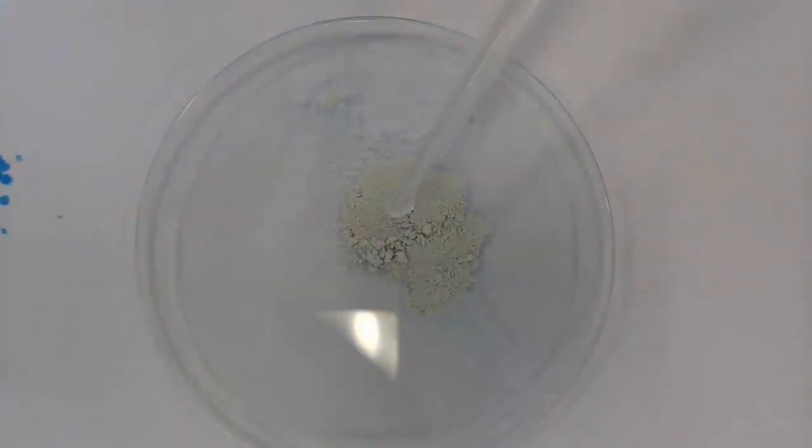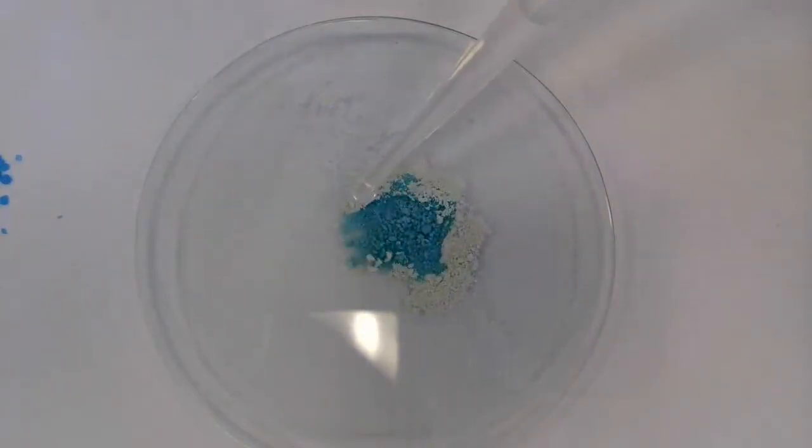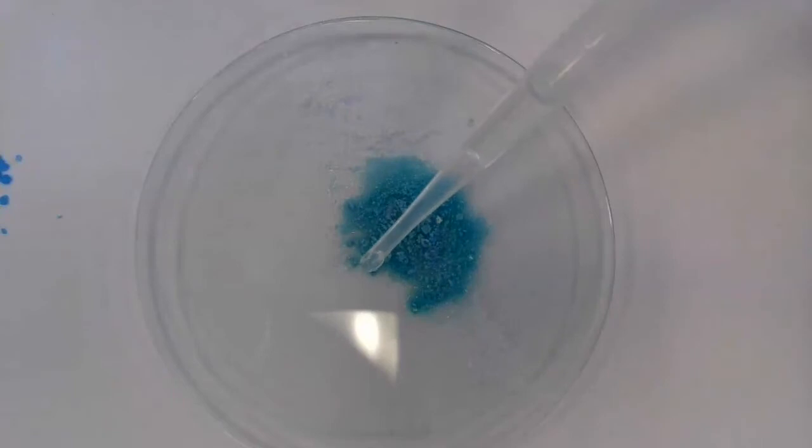Okay, so there is my white anhydrous copper sulfate. And to that I'm going to add a couple of drops of water. And you should see it immediately turns blue. Adding water turns it back into the hydrated copper sulfate, which as we all know is a nice blue colour. That's quite an exothermic reaction, but it's turned the white anhydrous blue.